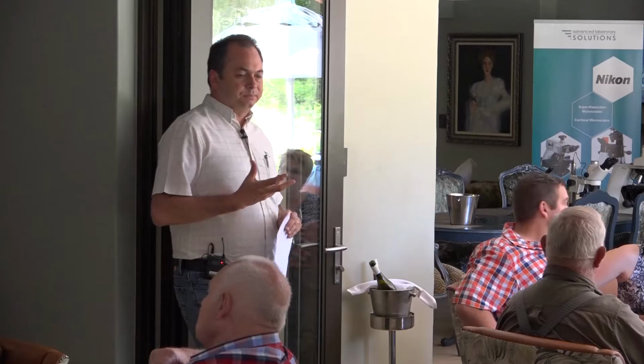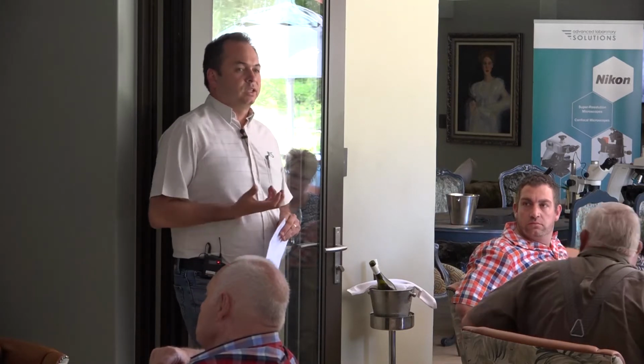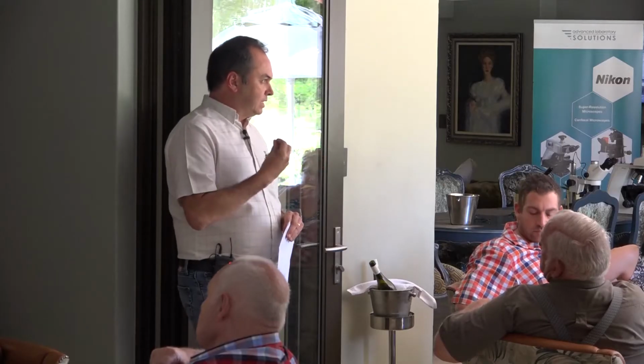So if we concentrate on the compound microscopes, which is the area of interest for you folk, there's lots of lighting techniques, and lighting techniques are basically a way to describe a technique in order to see what you want to see. So the most common one is bright field. This is where you have just a sample and you see it, let's say, in its natural state. So just with ordinary light that comes from the globe.